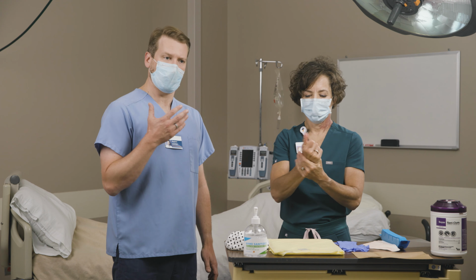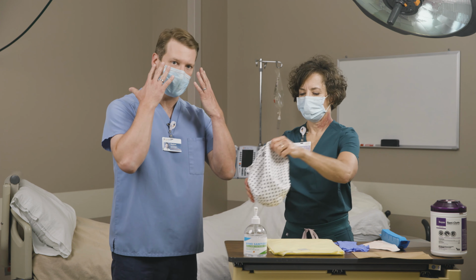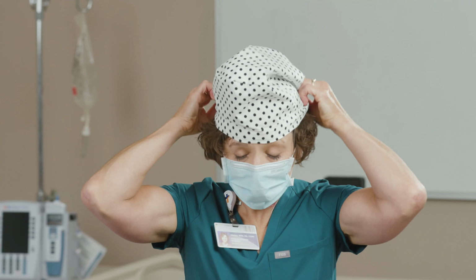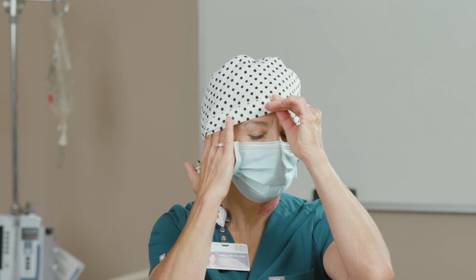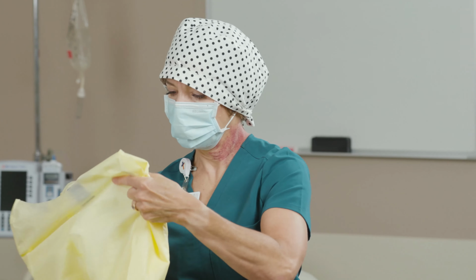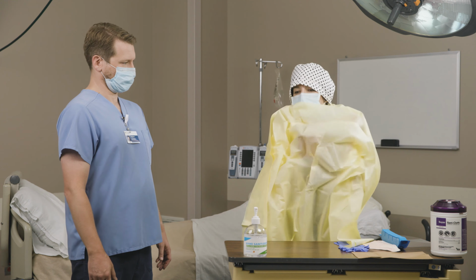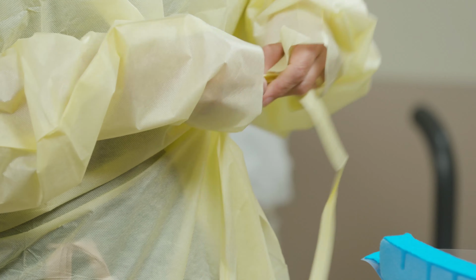The key point here is we don't want anybody's hair getting into their face where they feel like they want to reach up and touch their face. So that's the most important part of this. If it's not appropriate for your hair, it's not a necessary step. Then she's going to don her gown. It's important to tie the gown to maintain safety.